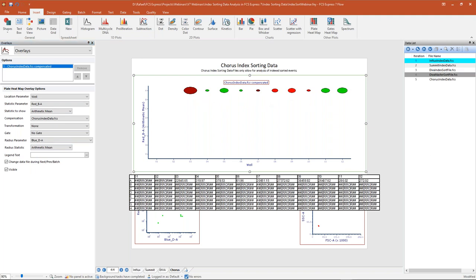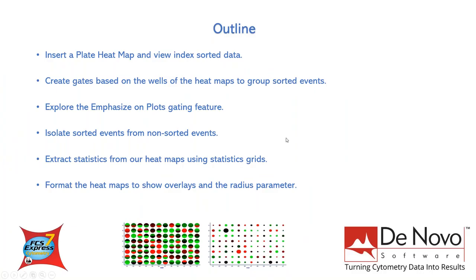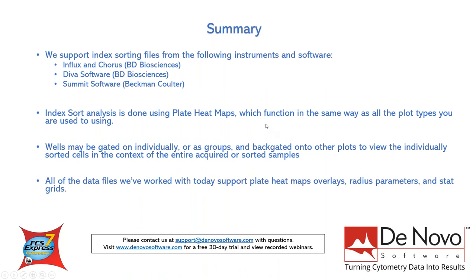With that, we've come to the end of our examples today. As a reminder, all of the data files we've worked with today support heat map overlays, the radius parameters, and the stats grids. Keep in mind that the heat maps function in the same way as all the other plot types you're used to using, and the well gates will function the same way as well. The index sorting data analysis will hopefully be a very familiar and simple process using our plate heat map plots.